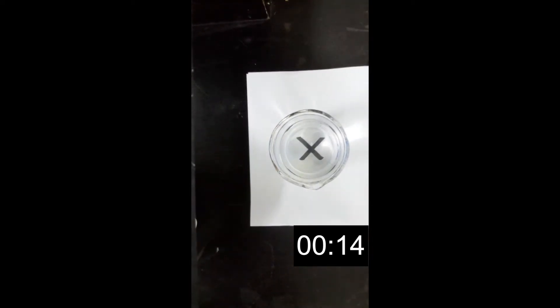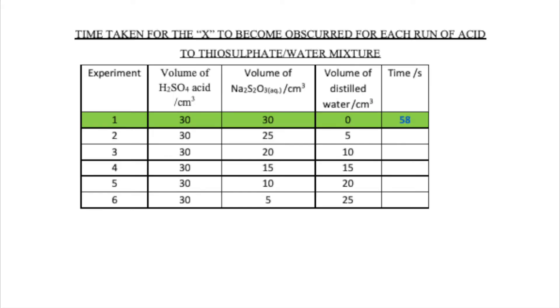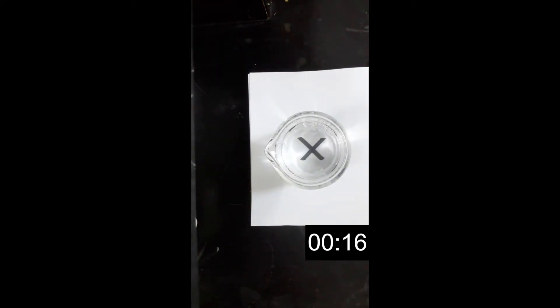We're going to look from above and stop the stopwatch the moment the cross disappears. In the second round, we will use 25 cm³ of sodium thiosulfate with 5 cm³ of water to make our volume up to 30 cm³. Again we start the stopwatch immediately and we wait for the cross to disappear.